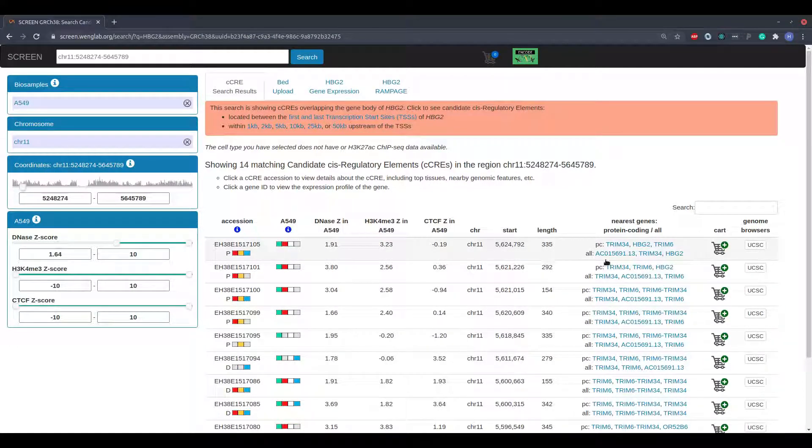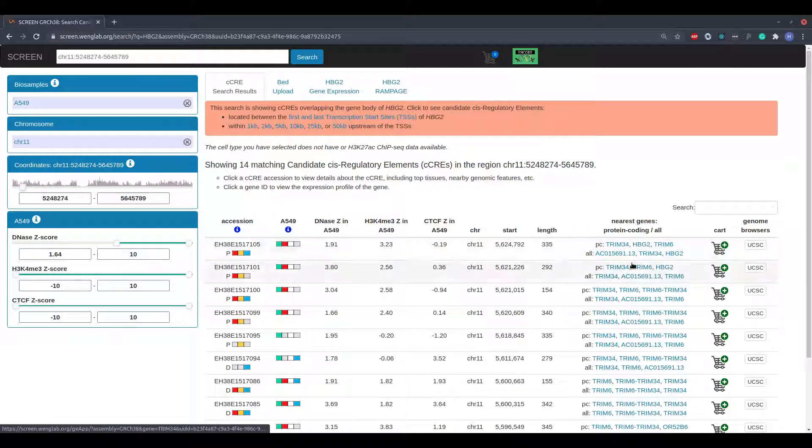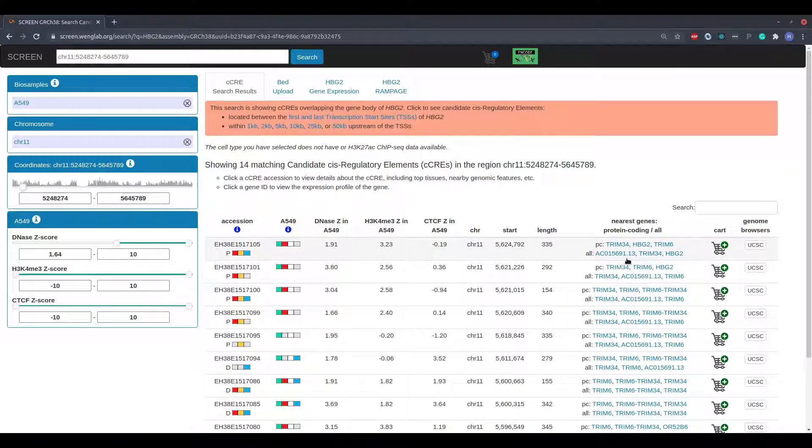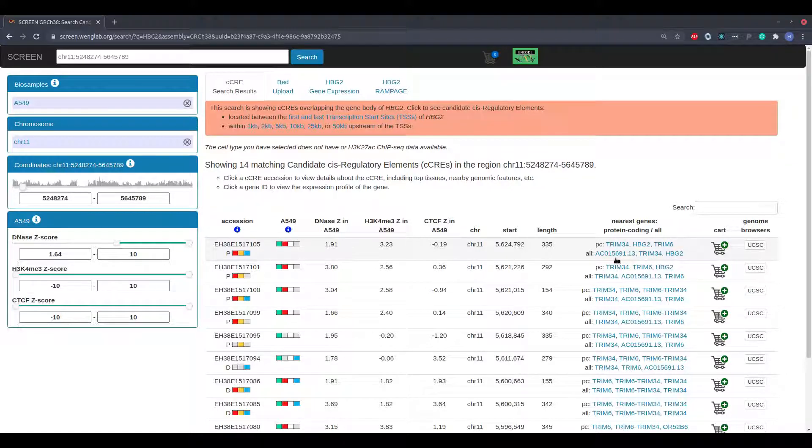The next column displays the top three nearest protein coding genes and the top three nearest genes regardless of coding potential to the candidate regulatory elements. Clicking on a link leads to the Gene Expression app.